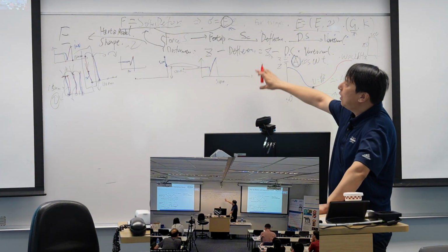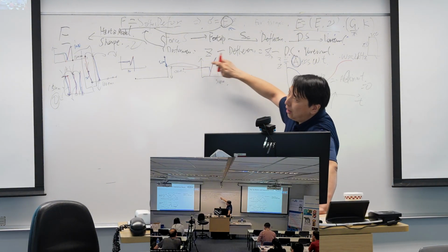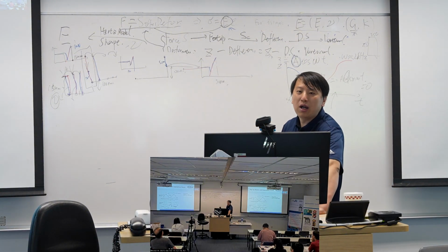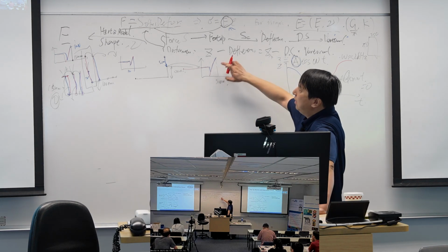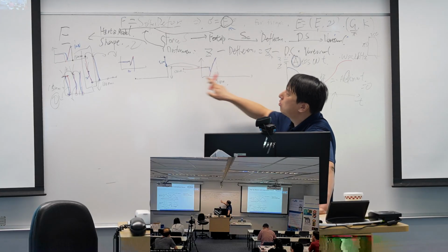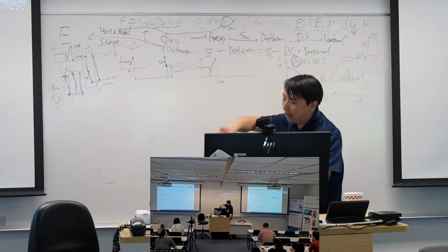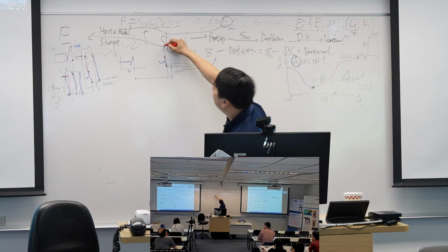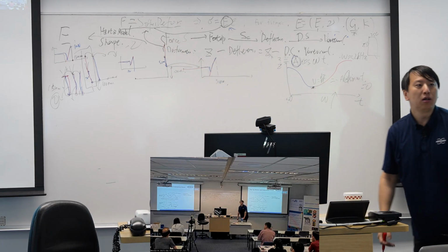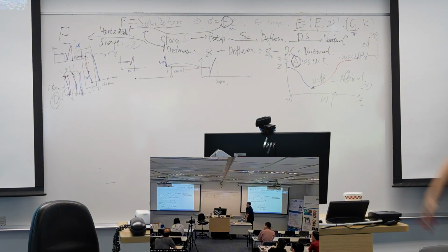So in this setup, the blue curve and the red curve traveling distances are not the same. It will depend on the topography of the sample. So that's why the blue curve after this first curve will be somewhere here. That's the total idea. I can drag the probe up.